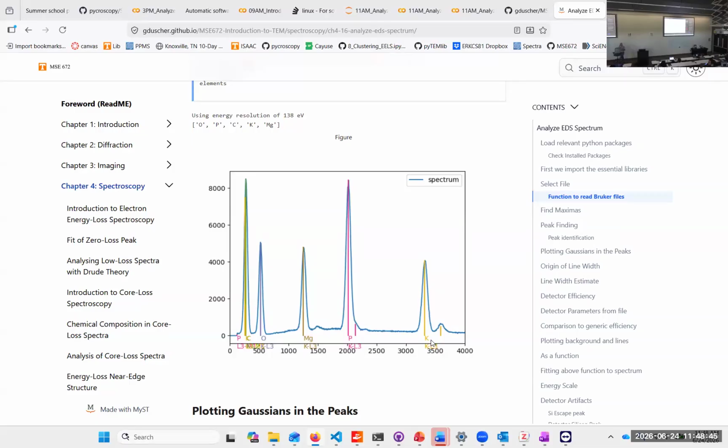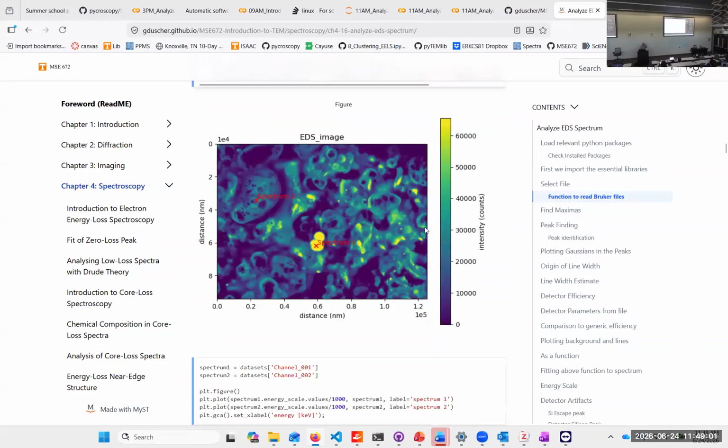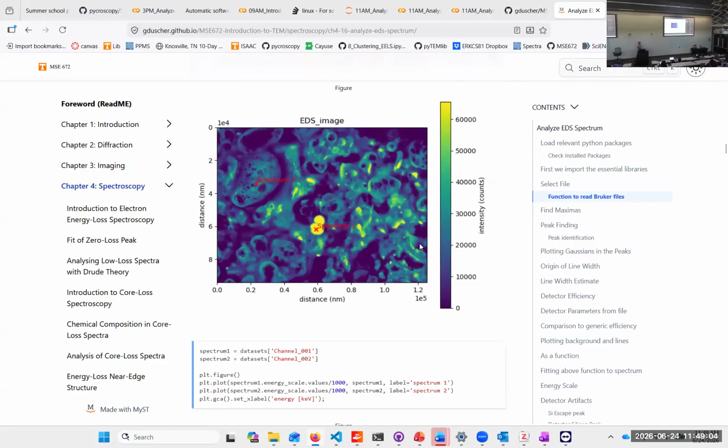Banana? Good guess. But the point is that the potassium and the magnesium are only in the bright one. Carbon and oxygen are in the other one. This is chocolate. Was it guessed in the chat? Chocolate. Good. Okay, we have a chocolate affinado.